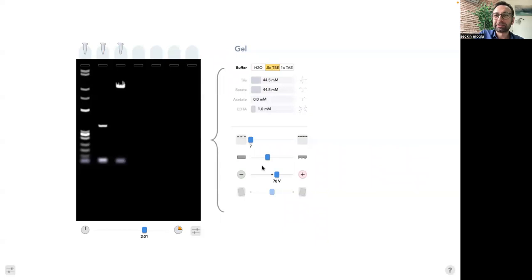And maybe 2 times in my life, what I saw was also the bands going in the wrong direction, like this. You can imagine why it is like that, because you put the plus and minus in the wrong place. But usually this doesn't happen.